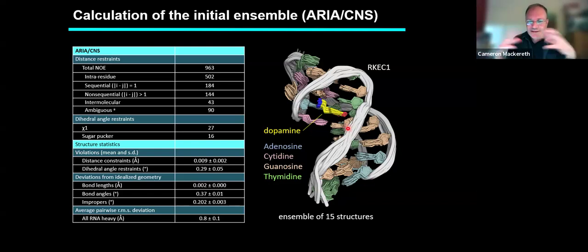So what the program does is it minimizes the structure so that all of these distance restraints are satisfied in the final structures. And that's great. The only problem with this particular program, it's excellent for proteins. The force fields, or the way that it takes care of DNA and RNA, and in particular bases and base stacking, is not optimal. So we typically need to use another program afterwards.